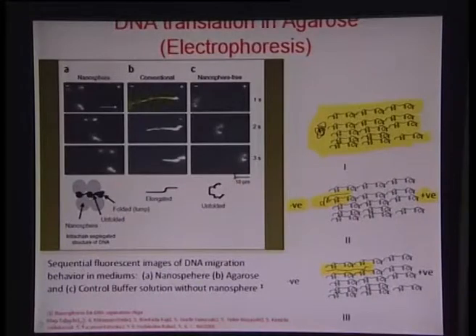and you can see this illustrated here by some of these figures which have been borrowed from a paper which was published some time back also in Nature, which talked about these DNA separation chips and the way DNA would be separated using nanospheres, using gel mediums, or using all sort of combinations. So, you can see here how this fluorescently labeled DNA is kind of stretching out, and as it goes along it again after a while rests at an area of the gel. So, that is how you can interpret DNA translation in agarose or electrophoresis in general.